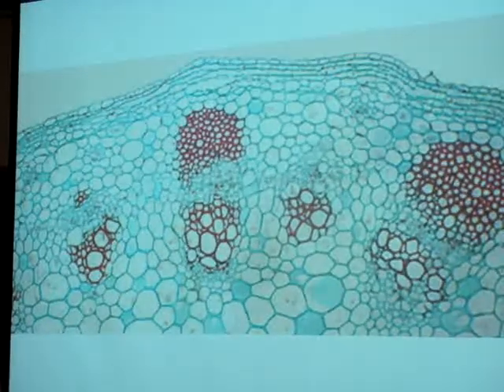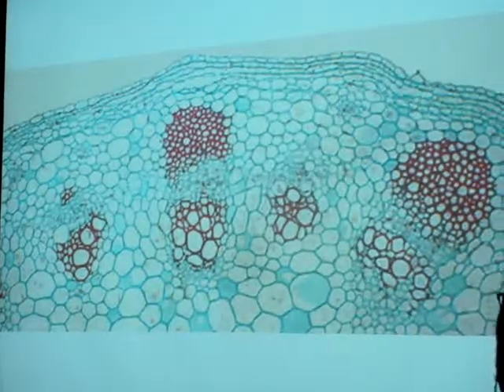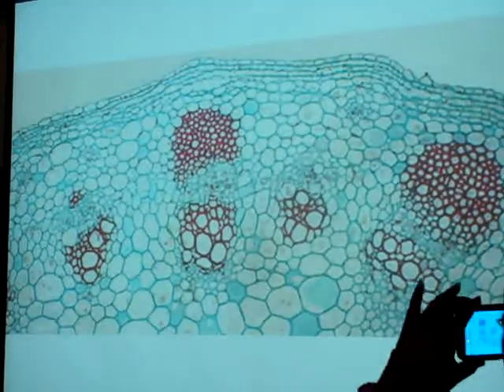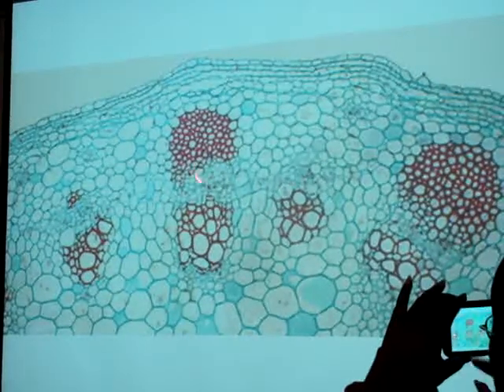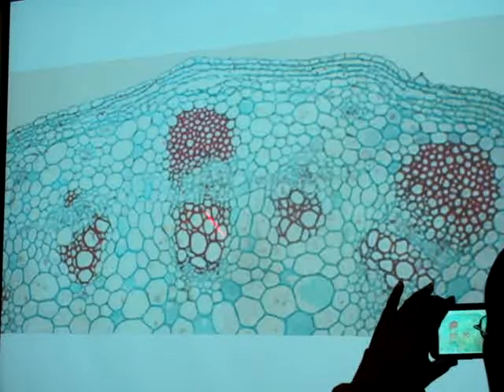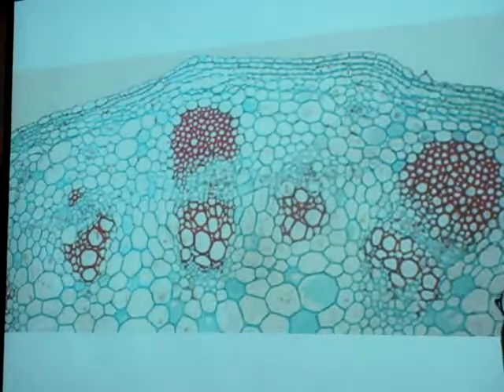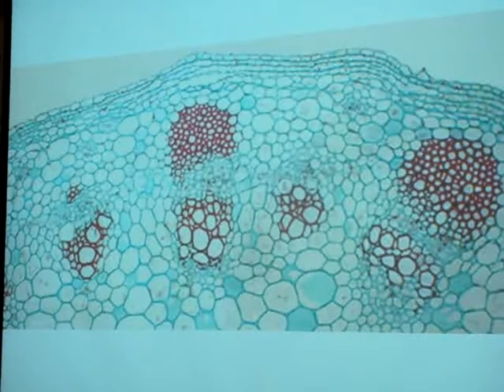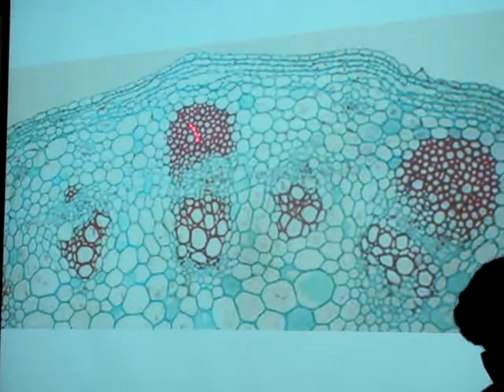More of the same. Now, this is a nice clear photo. You can see your tissue types. So you can see your xylem, your phloem. You can't really, the pericycle is kind of weak here. Xylem, phloem, sclerenchyma. See them, y'all? So let's just run with tissues. Xylem, phloem, sclerenchyma.